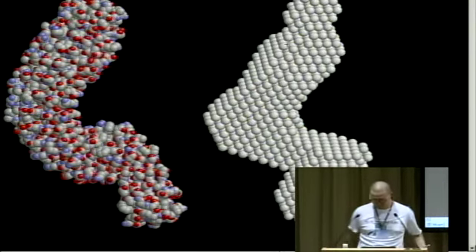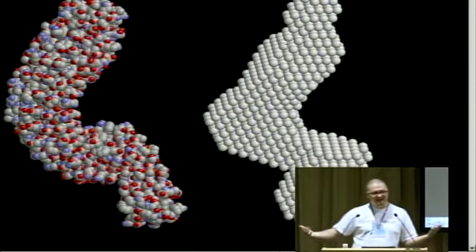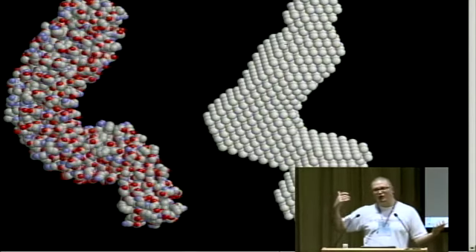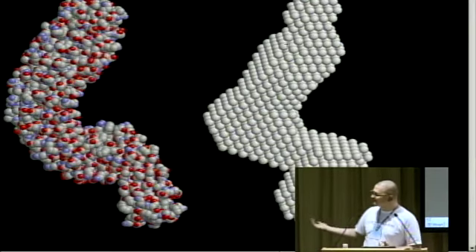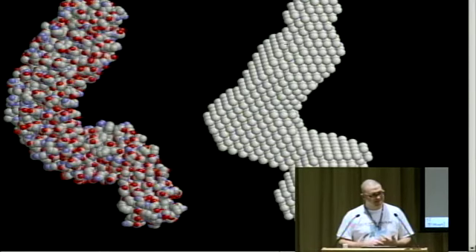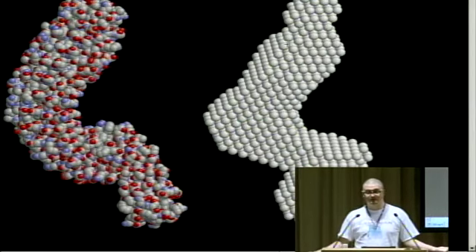Come on. So anyway, that again gives you an idea how good or how bad ab initio shape reconstruction is. And here you can see that actually it's not that bad. For a very low resolution method that is performed on a sample in solution, you can get the overall shape in just a few minutes.